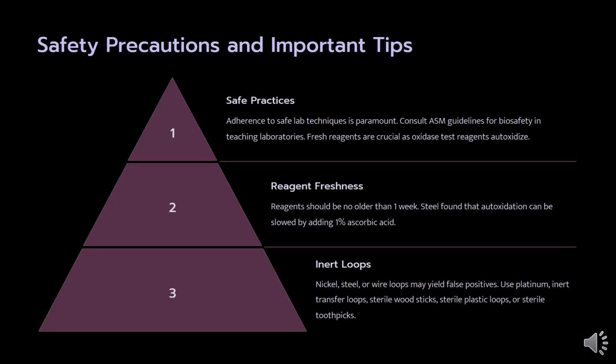Safety precautions. Adhering to lab safety techniques is paramount. Consult ASM guidelines for biosafety in teaching laboratories. Fresh reagents are crucial for the oxidase test, as reagents auto-oxidize. Reagent freshness. Reagents should not be older than 1 week. Auto-oxidation can be slowed by 1% ascorbic acid.